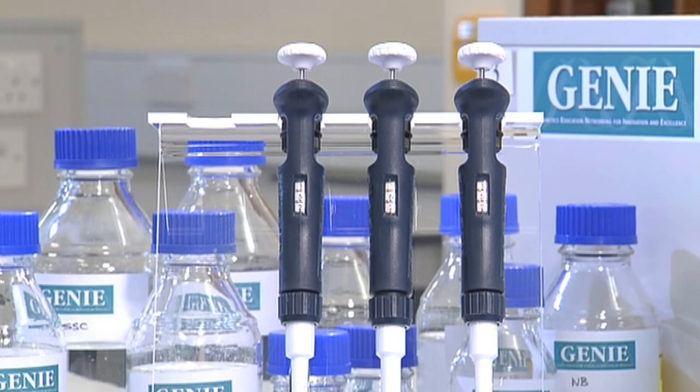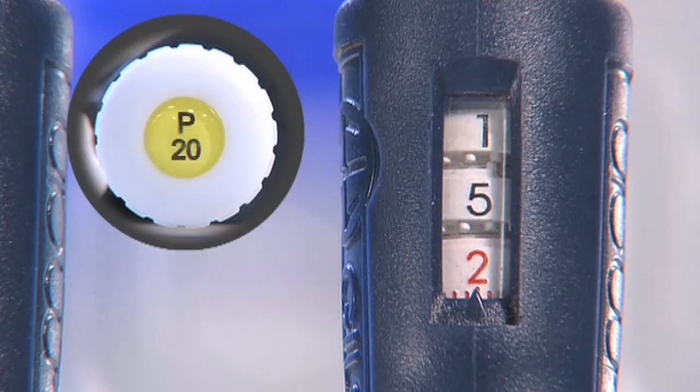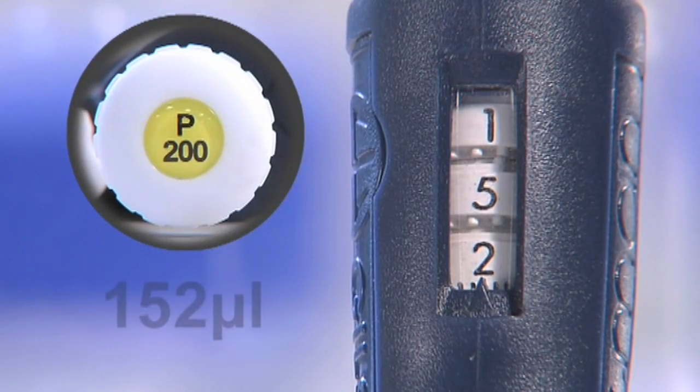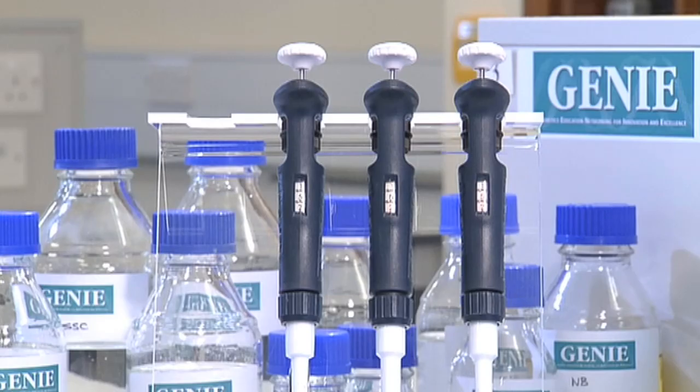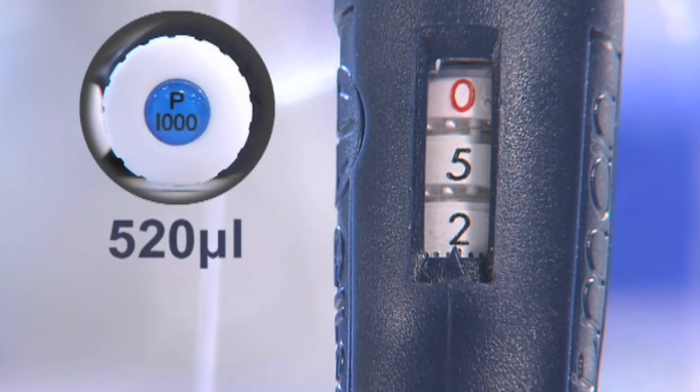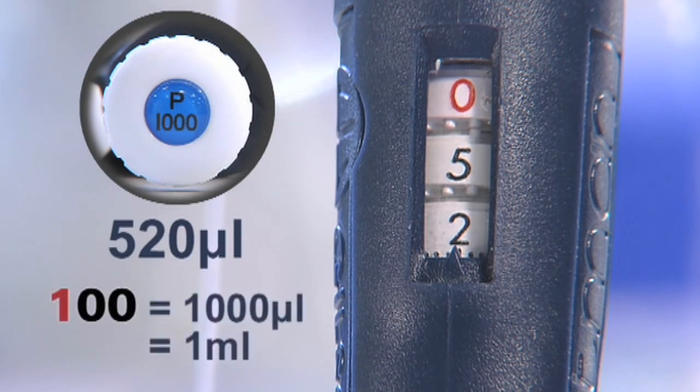For example, these pipettes have been set to read the same numbers on the dial: 152. For the P20, this means the pipette is set to 15.2 microlitres — the red bottom dial shows two tenths of a microlitre. With the P200, the same visual setting means 152 microlitres. This P1000 is set to 052, which indicates 520 microlitres. A setting of 100 indicates the maximum volume for this pipette, which is 1,000 microlitres.